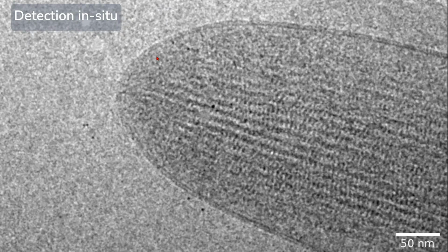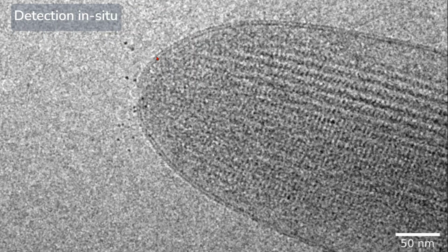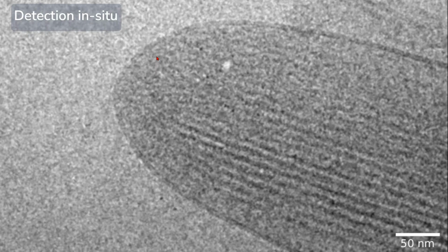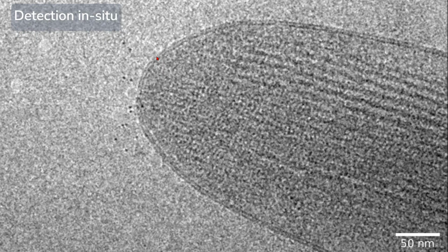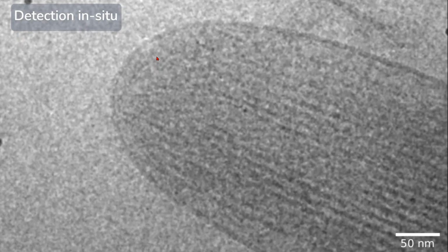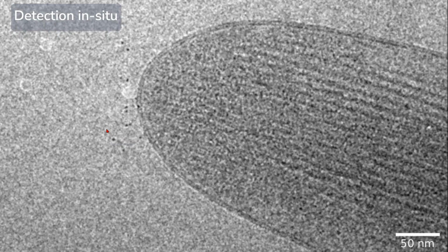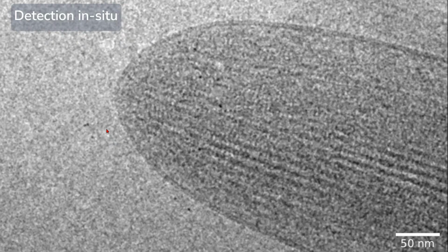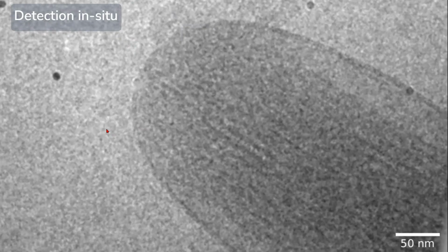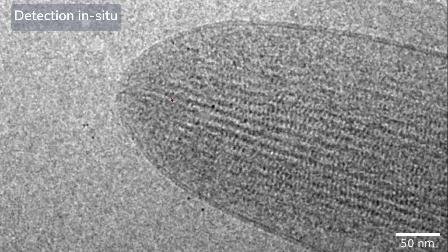And that was our first indication that we were really able to label individual protocadherin-15 molecules in stereocilia and take images of them. And the other thing that immediately jumped out to us is, like in the early cartoons I showed you, it's always assumed that there would be like one copy of the protocadherin-15 dimer at the tip. But here it was immediately obvious that there were clearly more than one.